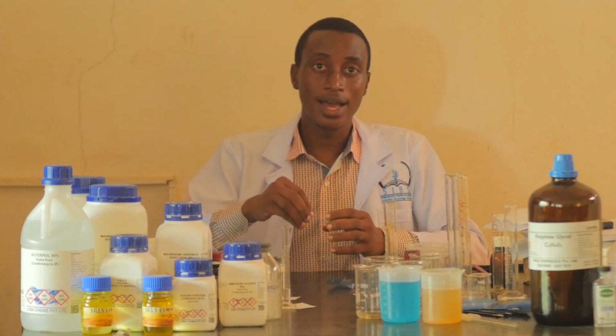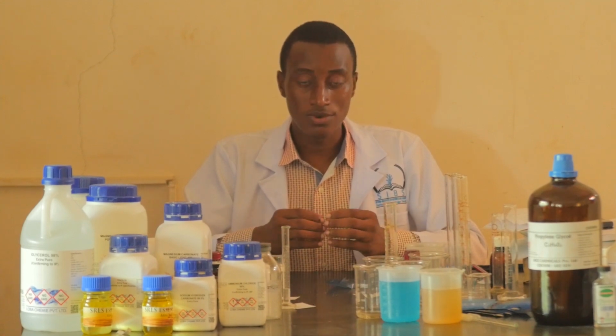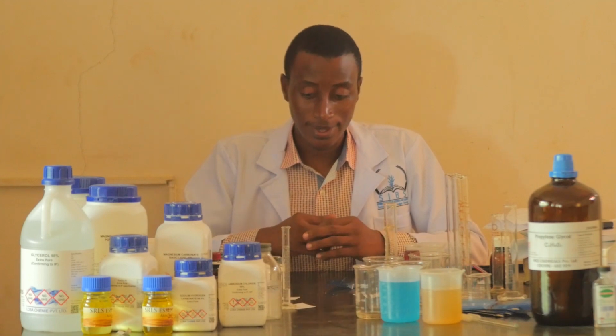And we shall add alcohol up to the required amount. So alcohol is going to be used as the vehicle, whereas potassium iodide solution is going to act as the co-solvent. And water should be our solvent, alcohol the vehicle, and iodine the active ingredient used as an antiseptic, though alcohol can do the same in antisepsis.